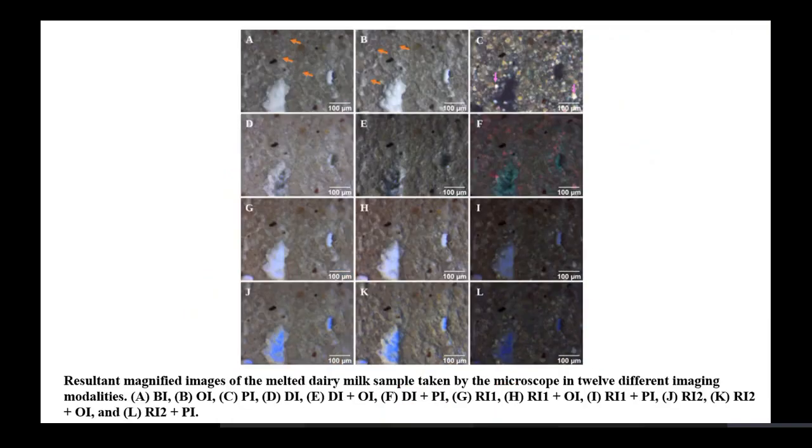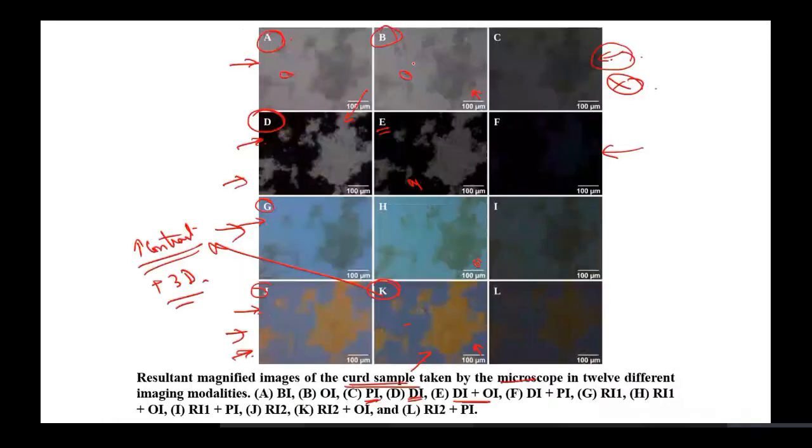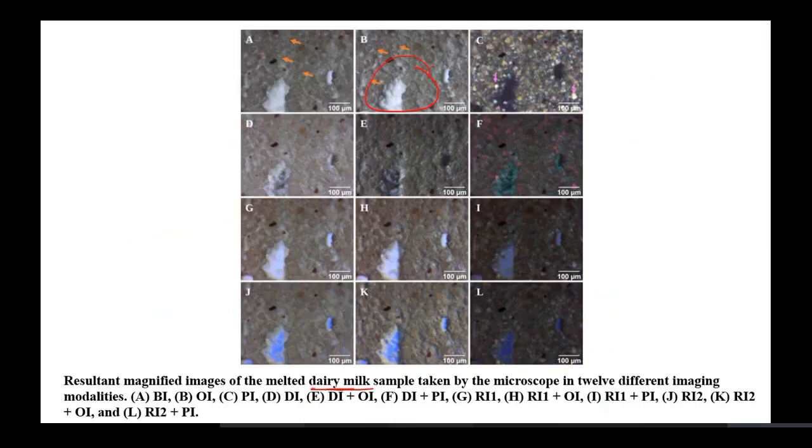Okay. Next, we use the Dairy Milk chocolate which is available. Now, if you see over here, the 3D effect is much more visible because the microstructures are quite good. In the previous case, it was not so visible because we had compressed the picture. If you see, there is a shadow, and here there is a brighter spot, right? Now, in the polarized light, you are having birefringent activity.